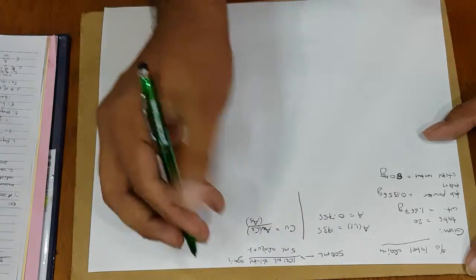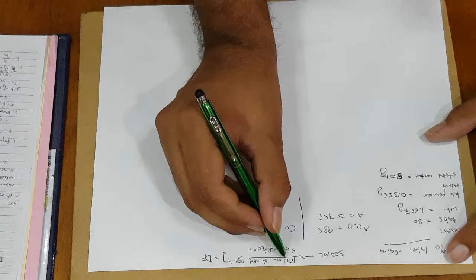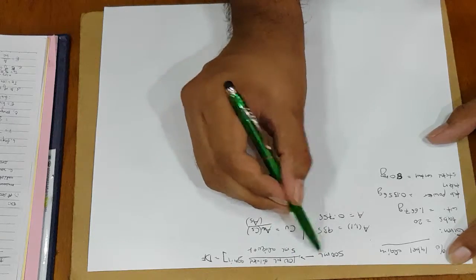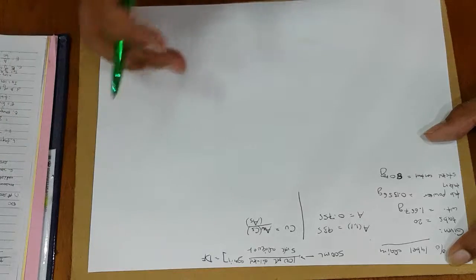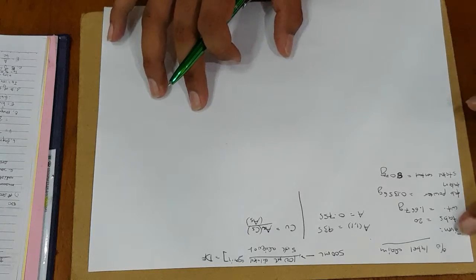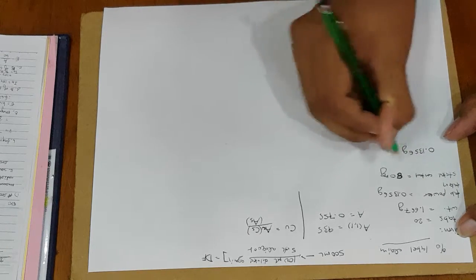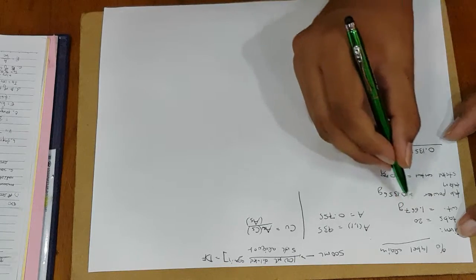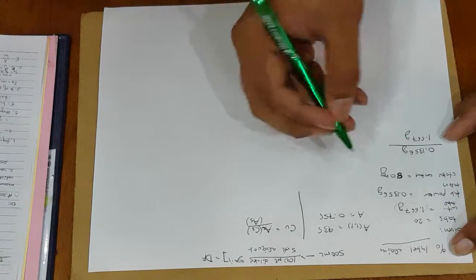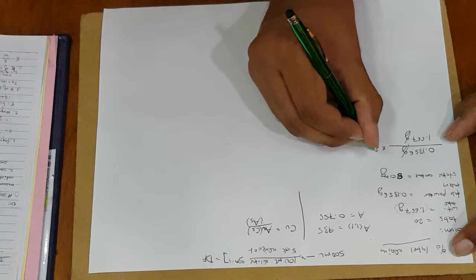You'll see later that this is your dilution factor, DF. Your aliquot is the denominator, and your numerator is the final volume which it was diluted to. So later we will multiply 100 over 5 by 500 ml. So first of all, you want to compute using your tablets. You get the weight taken, which was 0.1356 grams. You divide it by the total weight of all these tablets, which was 1.667 grams. And then how many tablets did we take? We took 20 tablets.